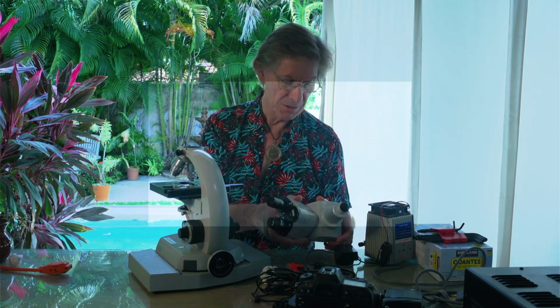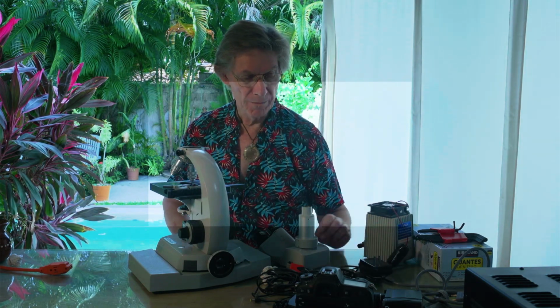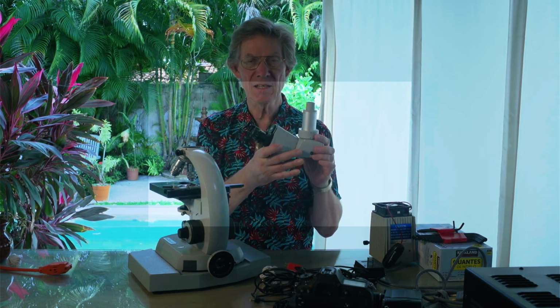So the microscope body looks like this. The next thing that we're going to look at is the binocular. Okay, this is not a binocular. This is a trinocular. And people say, what do you mean, trinocular? I've heard of binoculars, but never trinoculars. Well, trinoculars means three. A binocular is two eyepieces. And through a binocular, you look out into the distance and you see things much closer. So a trinocular is this, and it does a couple of different things.